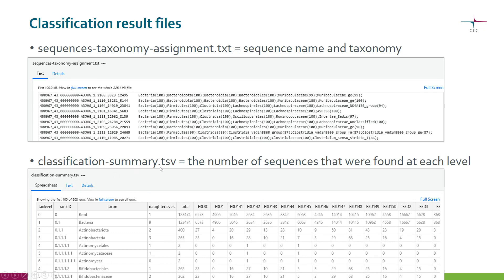The classification summary file shows the numbers of sequences that were found at each level. Here we have the taxons at the different levels, and then we have the numbers in total and per sample for these different taxa — so the number of sequences.